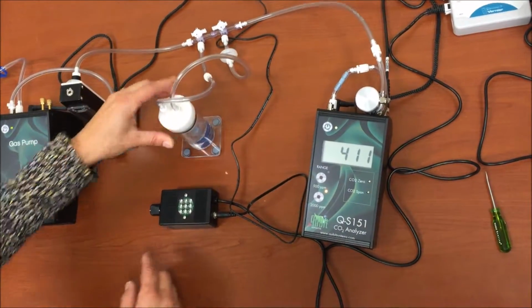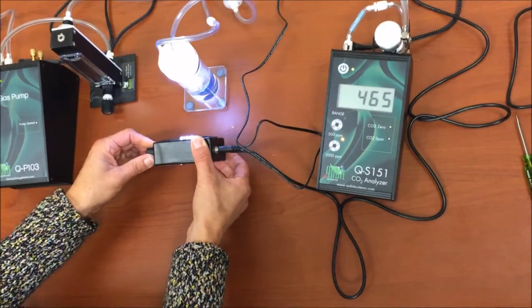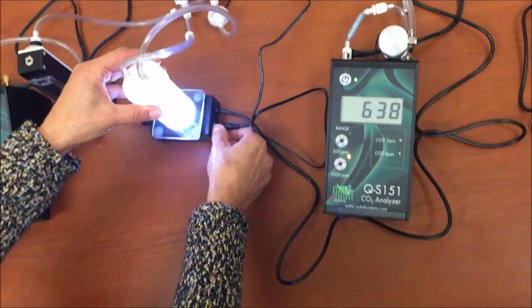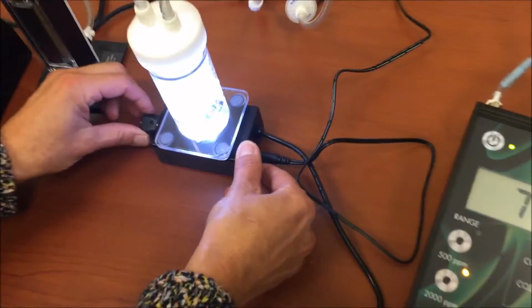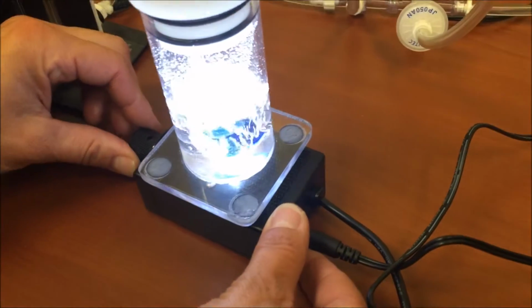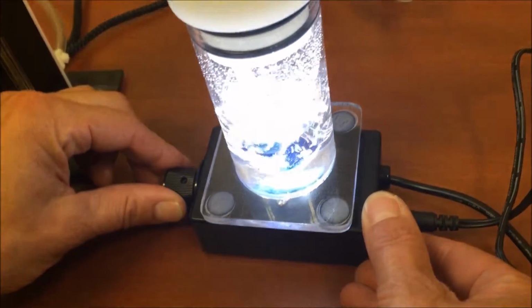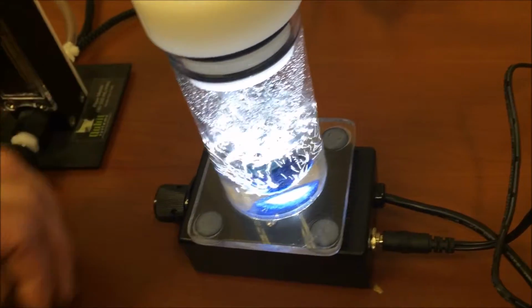this chamber. We also have as an optional component an LED light source that is used to illuminate the culture by placing the culture directly on top of the light source. This light source can be regulated with this knob on the side here, and the level of light will be recorded in the software, and I will show you in a few minutes how that is done.